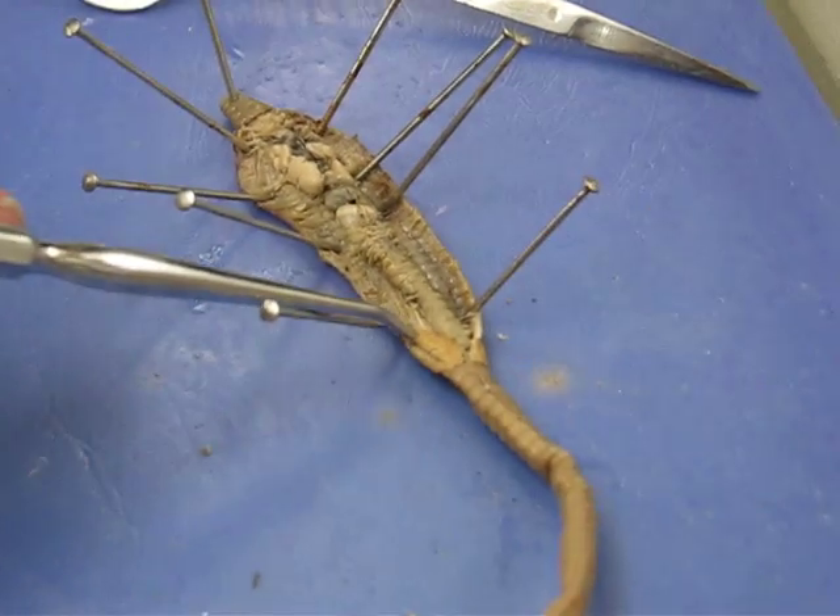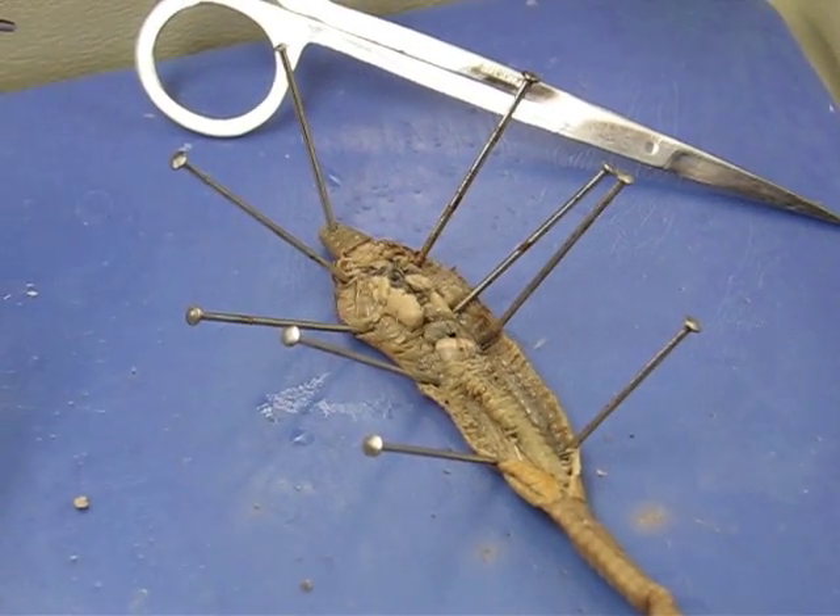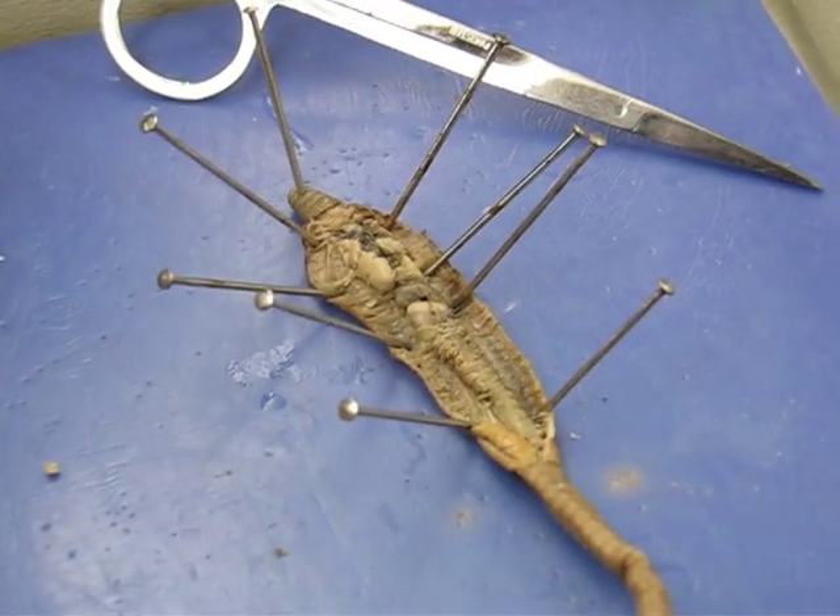This is the clitellum on the outside here. The mouth is up here and that's about it.